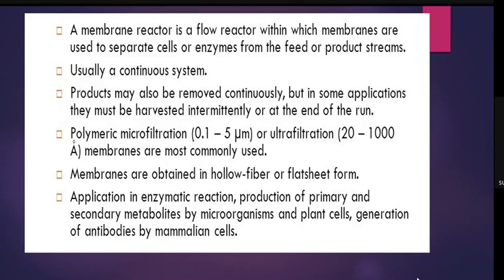What exactly happens is that the feed, that is, whenever we are inoculating the medium as well as the organism, all the reaction will happen inside it, and it will pass through a membrane from which only the liquids will come through. If we want our desired products, we should select the filter based on the membrane, so that only that exact pore size can enter, while the microorganism or your products are held back. Then after a wash, we can achieve it.